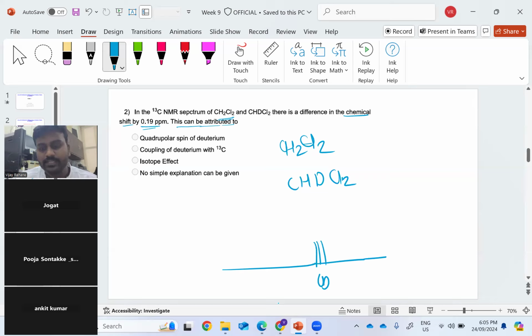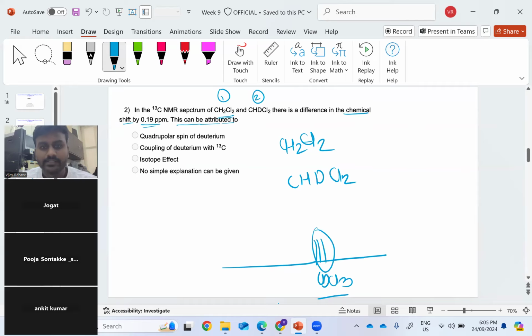But let's take the example of the NMR spectra of the first sample and the second sample in CDCl3. This spectrum was observed due to the CDCl3. Then if you look at the NMR signal due to the DCM for sample one, you get one signal.